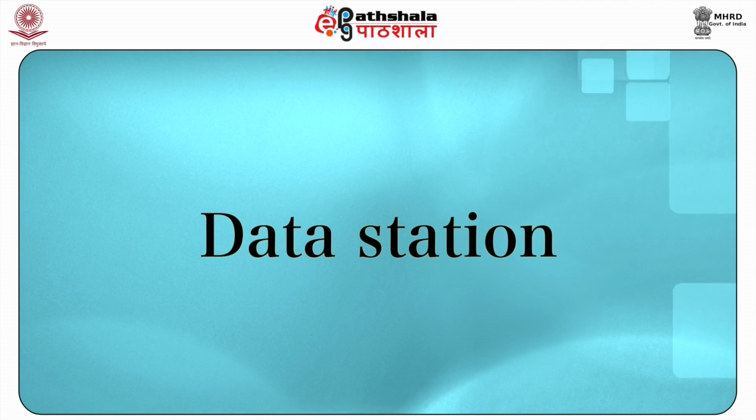Next is data station. The data station consists of a PC, an integrator or printer that, in addition to revealing the chromatograms, stores and monitors various parameters related to the system. The PC selected should be compatible with the main system.